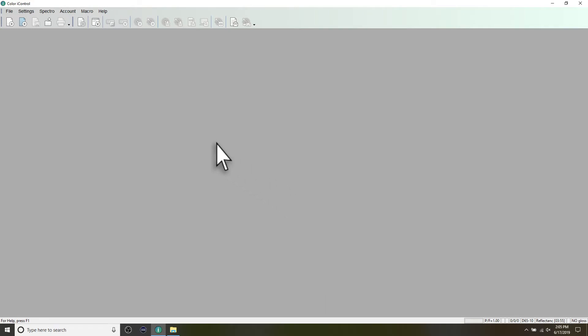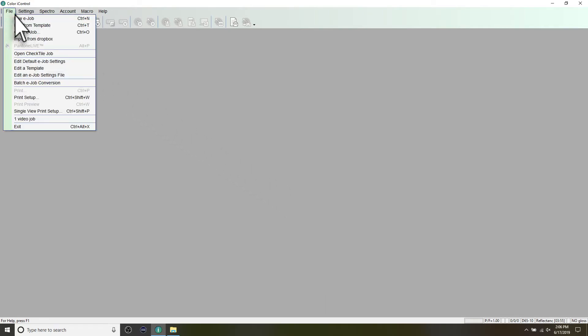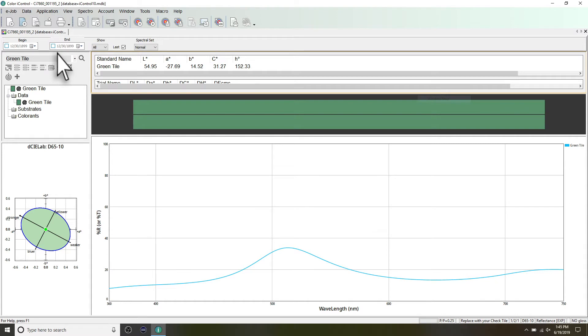Afterwards, open the check tile job. The default tolerance is 0.25 Delta E CMC. Any reading above this will fail the check.